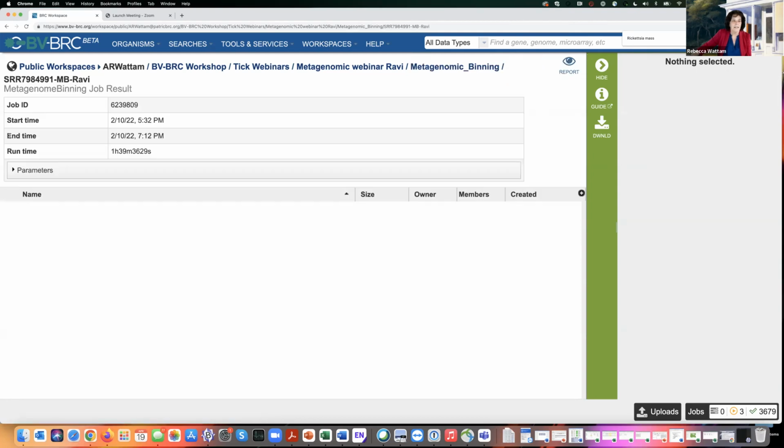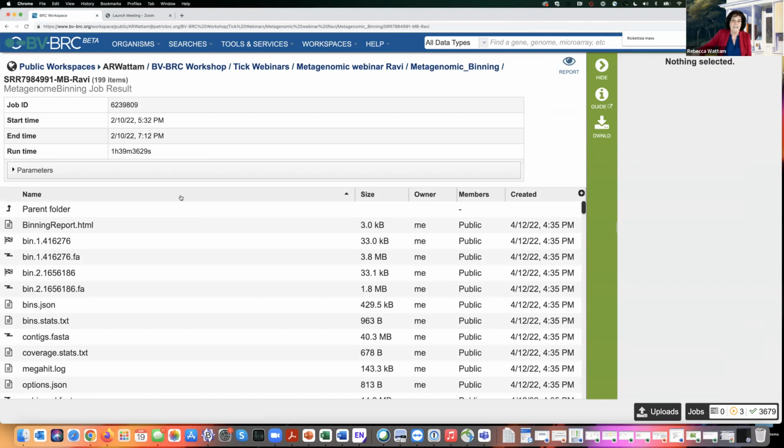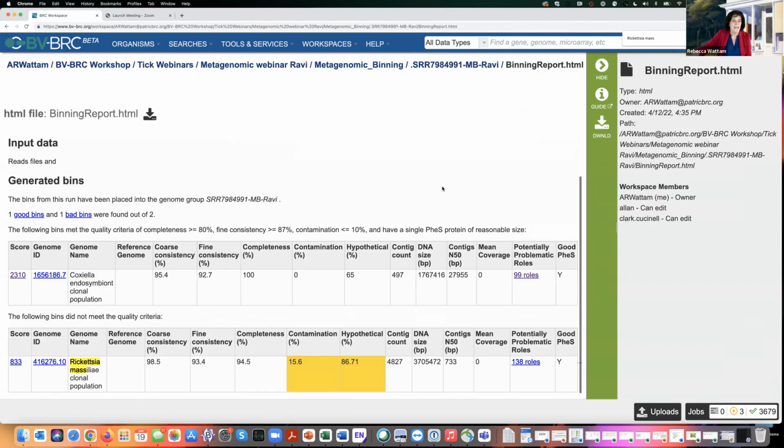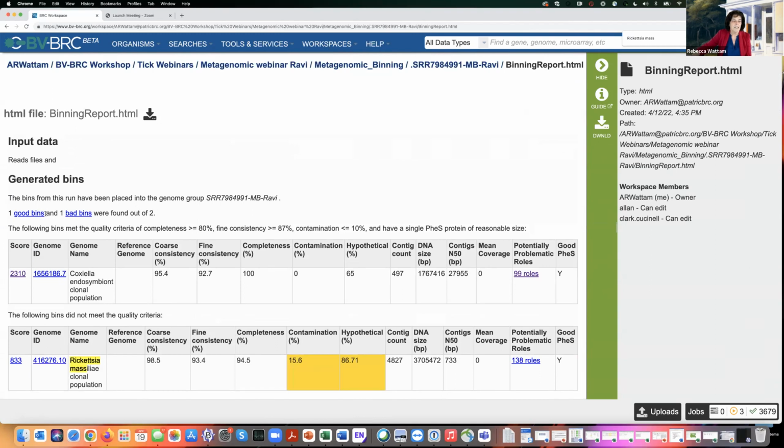So I click on that. And once again, you can go into the tutorials to find out what all of these things mean, but I want to look at the binning report. So let's click on that. And it tells me I was able to get a good bin and a bad bin. What's a bin? A bin's a genome.